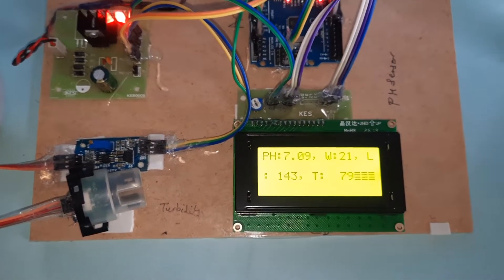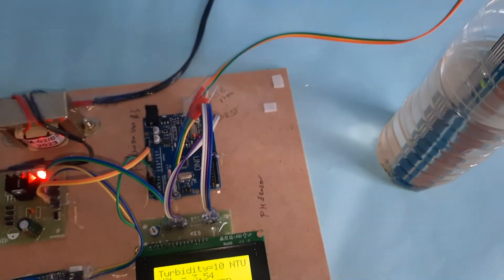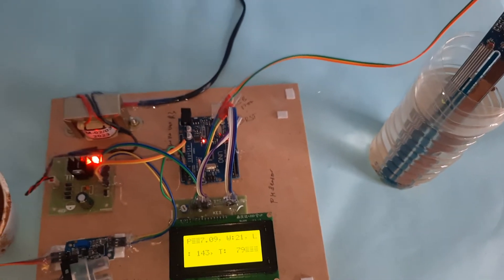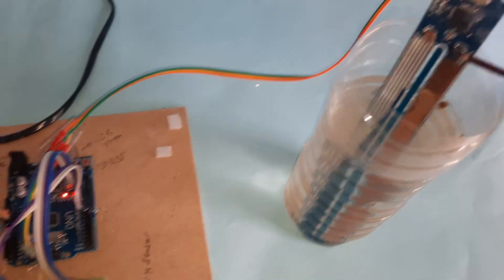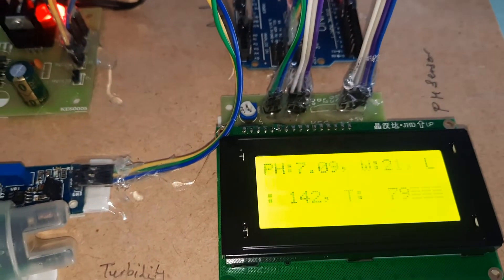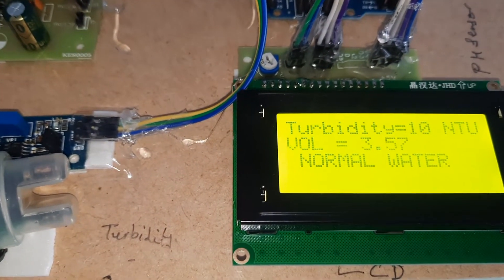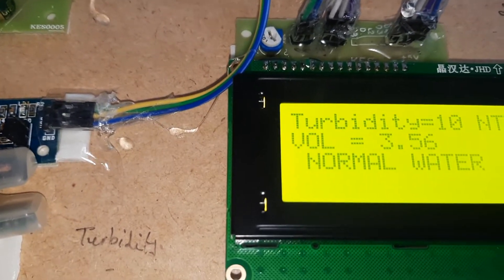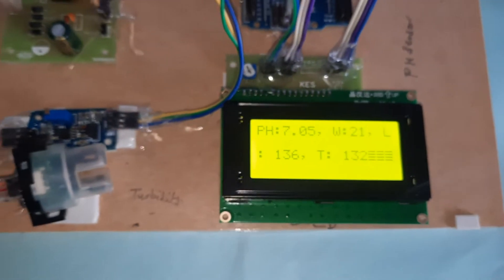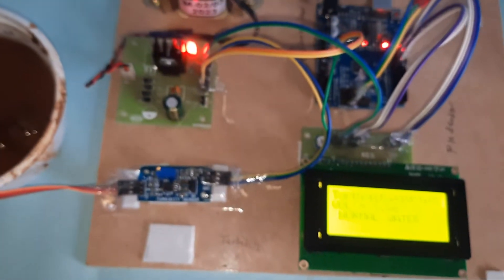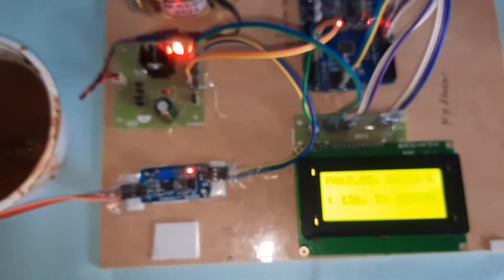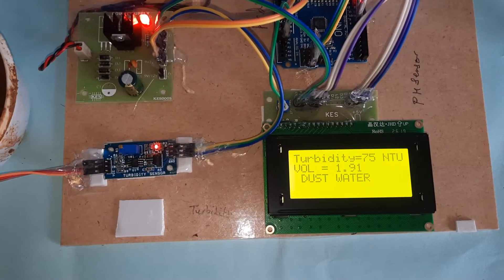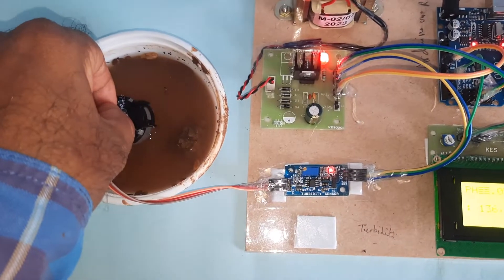If you are going to increase the temperature, the temperature value is also increasing. pH, water level, LDR. Now I'm going to insert the dust water.